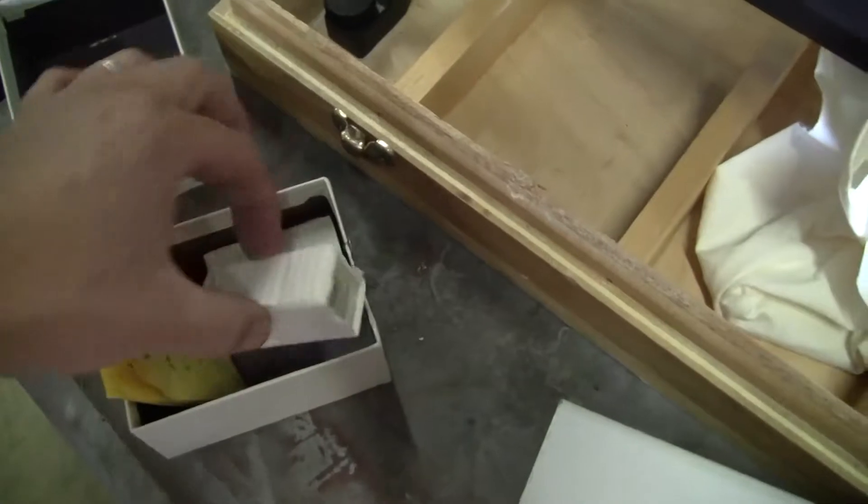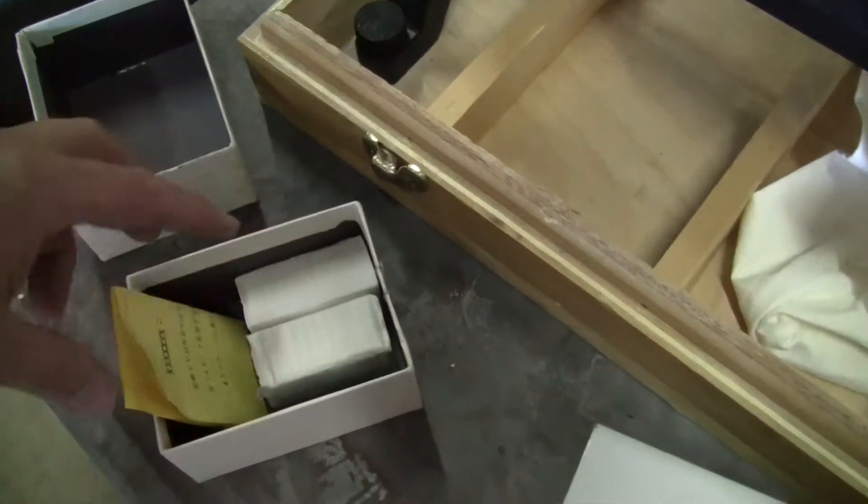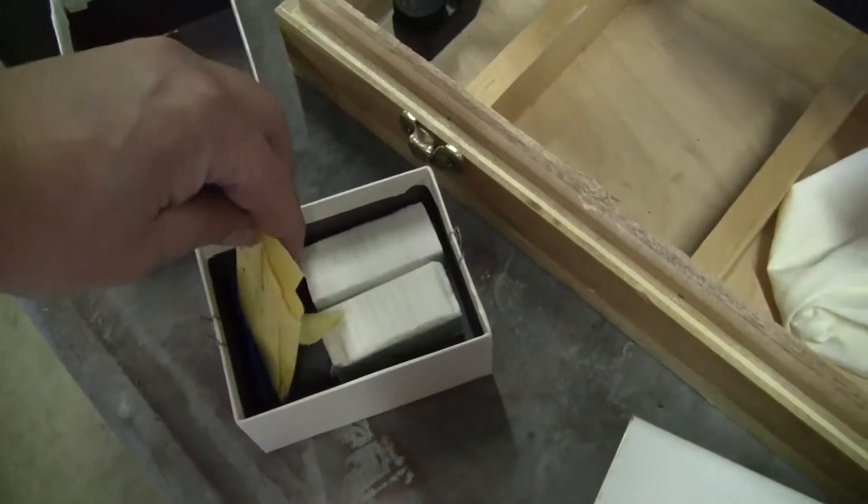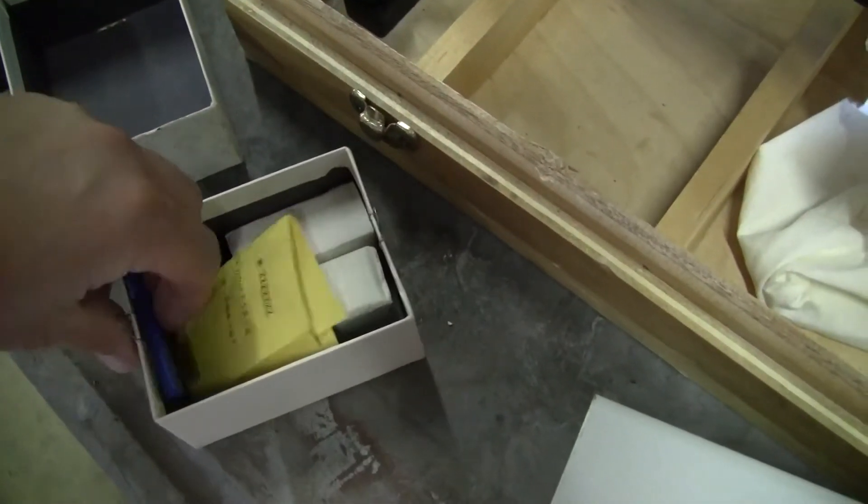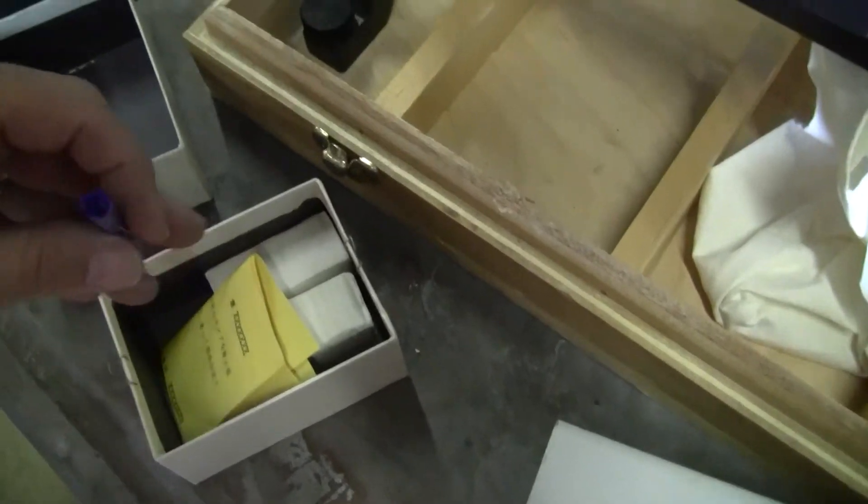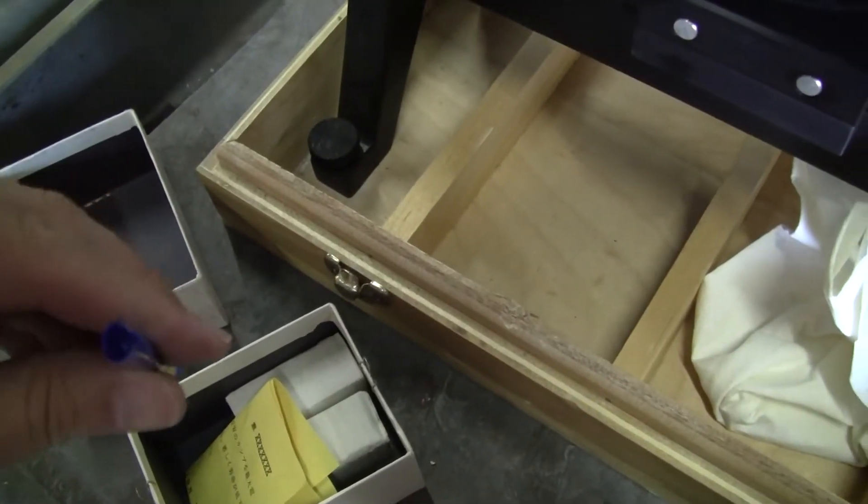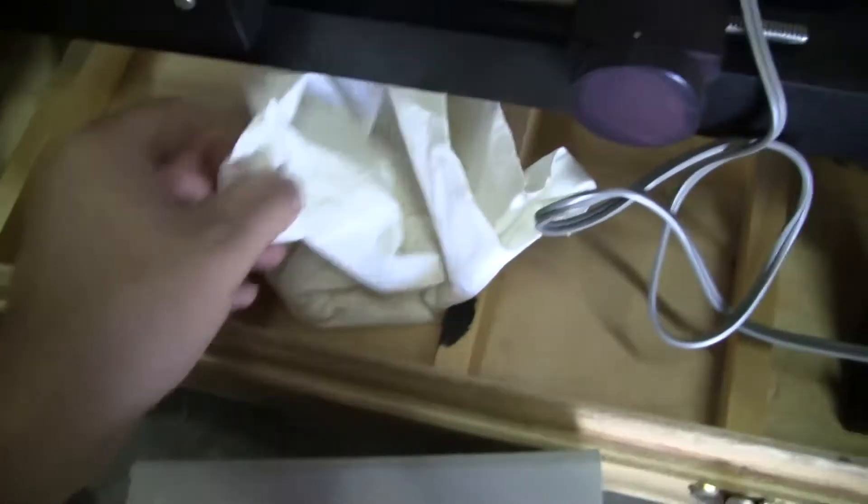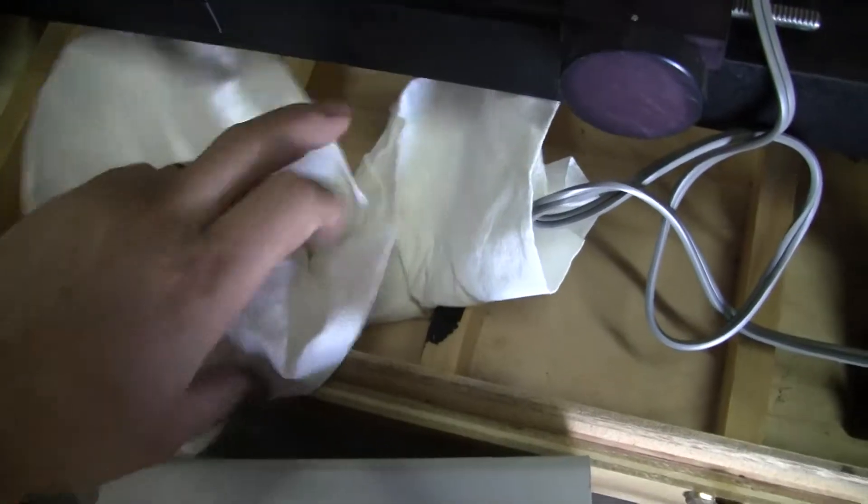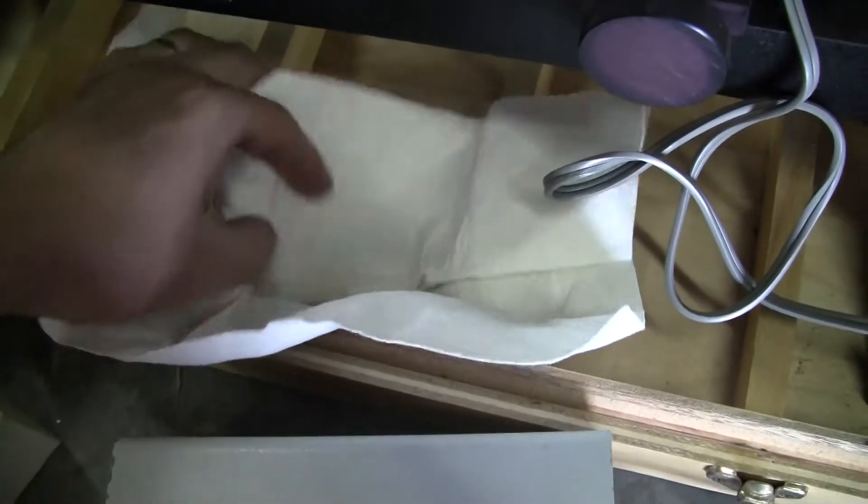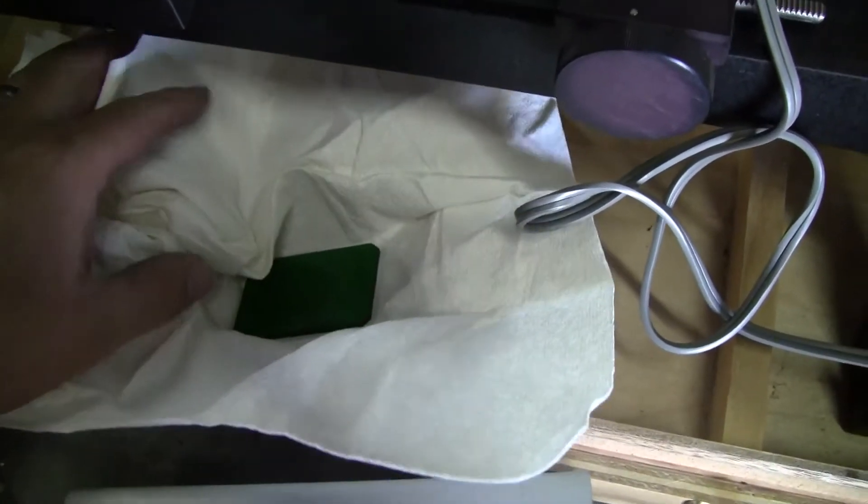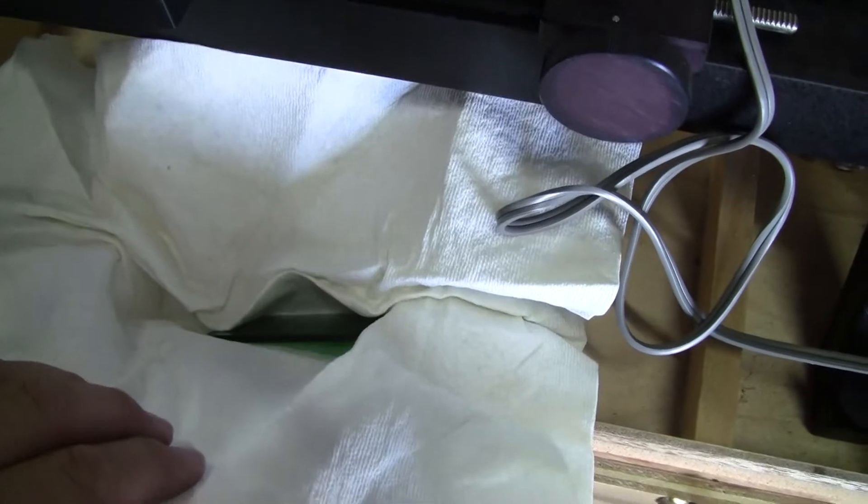There seems to be two extra bulbs, and what looks like some kind of filaments or pieces of paper. Slides.